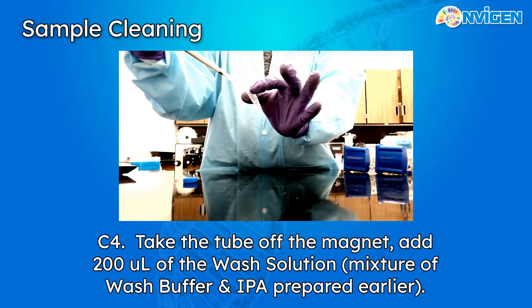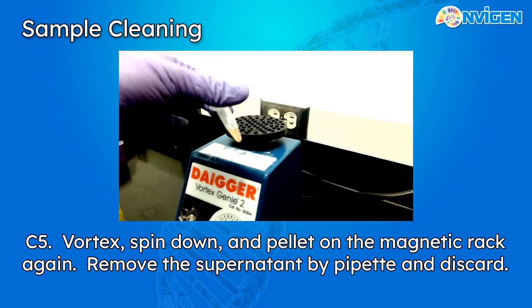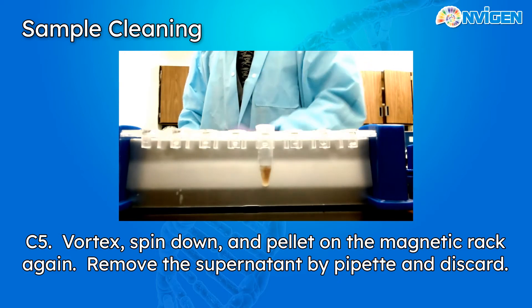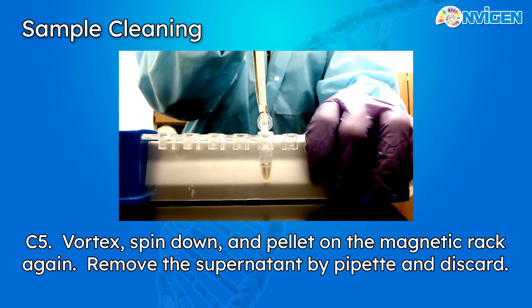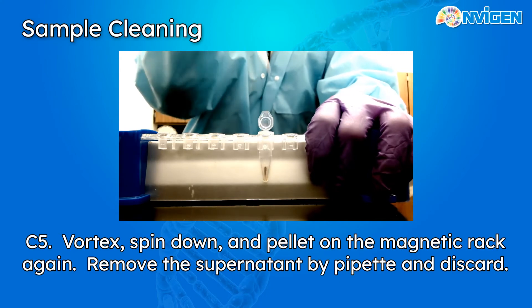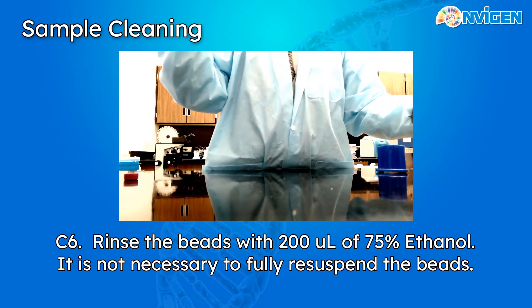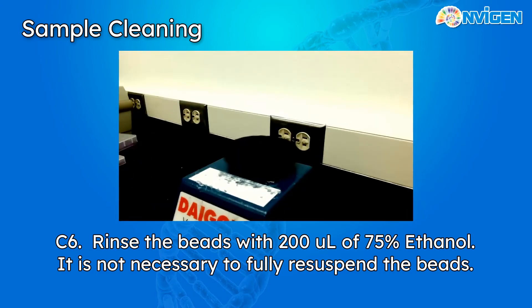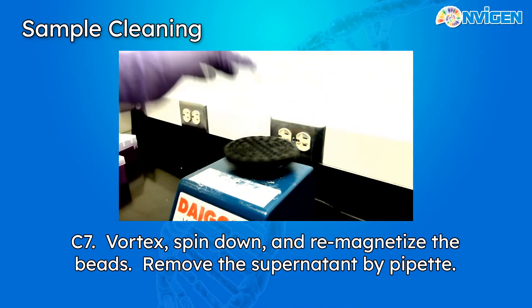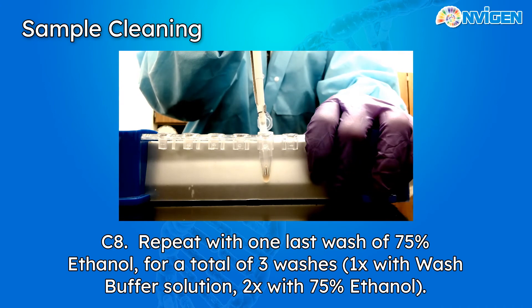Once the wash buffer has been added, vortex thoroughly to re-suspend the beads, then centrifuge down and pellet the nanoparticles on our magnetic rack. Now that the beads have been pelleted, once again remove the supernatant carefully. Then add the ethanol wash — 75% ethanol, 200 microliters total. Vortex the tube to re-suspend the pellets; sometimes the beads will cling to the sidewalls of the vessel. Magnetize once again. We'll be doing this two times total because there are going to be two ethanol washes to make sure the beads are nice and clean.